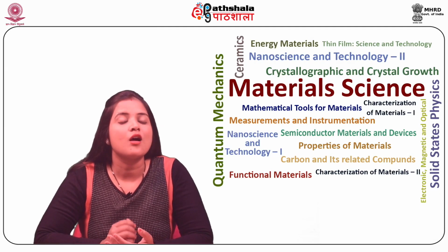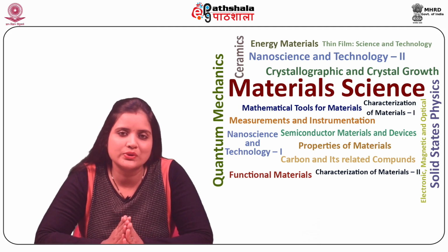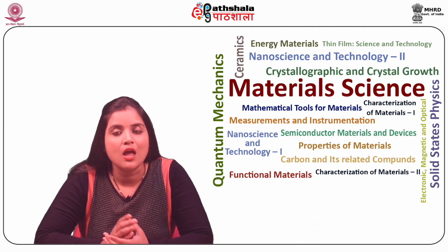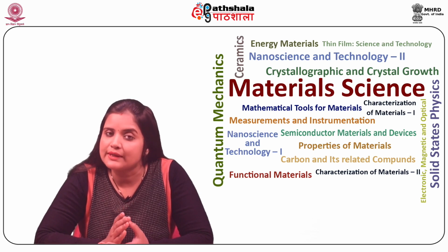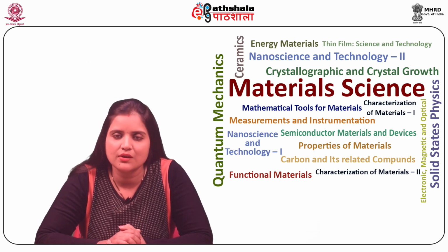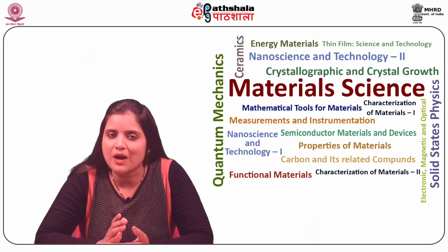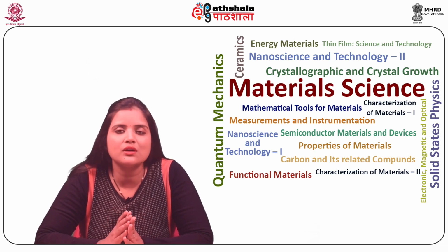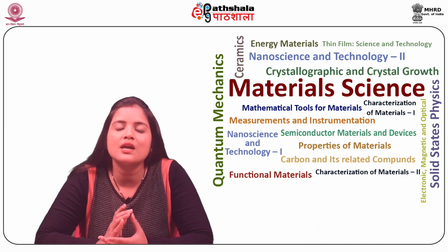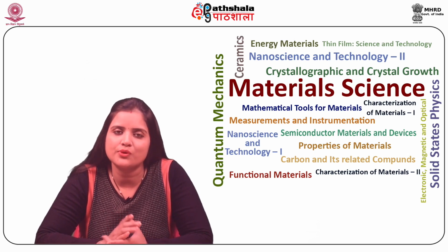Let us now discuss the feedback mechanisms. Feedback mechanisms are usually used to achieve high resolution and artifact-free images, since the detector must be positioned within a few nanometers of the surfaces. Some of these mechanisms are: number 1, constant force feedback. This mode is very similar to the feedback mechanism used in atomic force microscopy, that is AFM. Experiments can be performed in contact, intermittent contact, and non-contact modes.